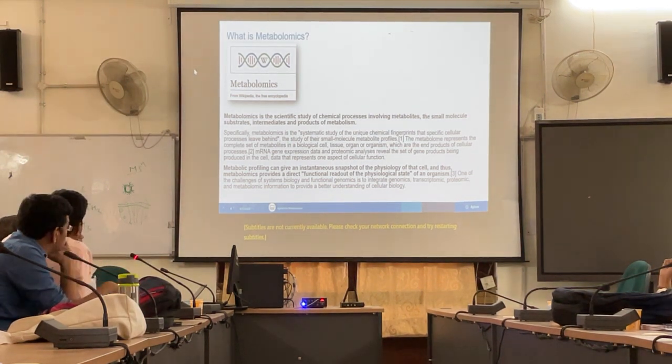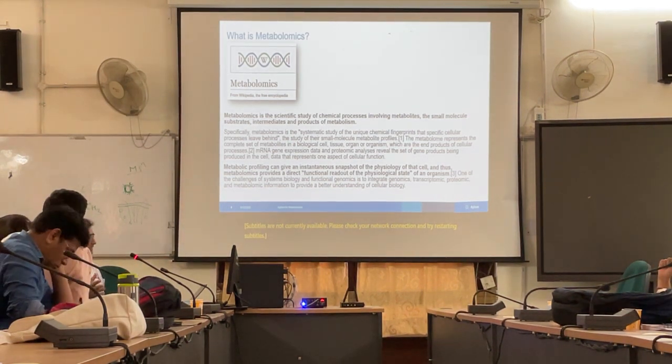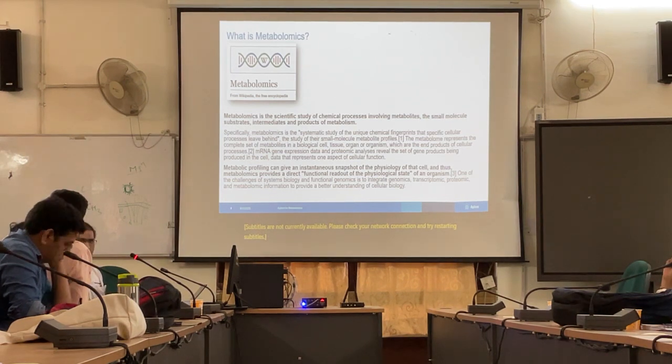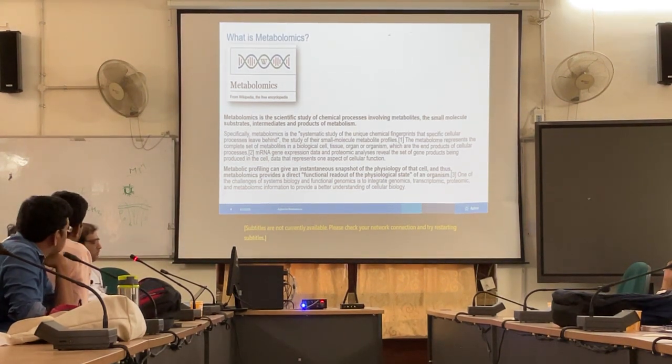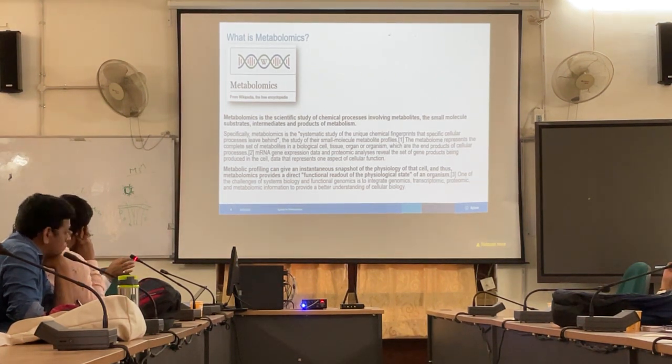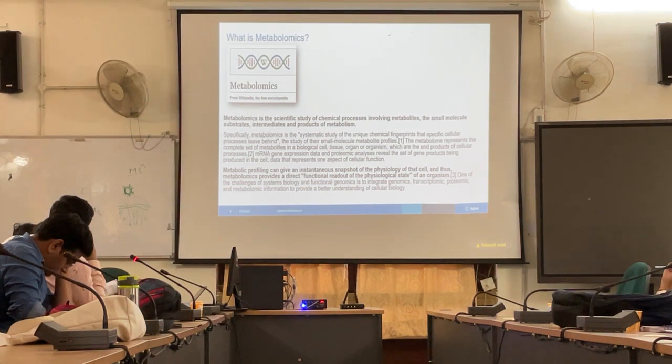Metabolomics is a new terminology which is coming into picture, but it is not something new to the concept of omics. For 20 years people have been working with omics, right? People started working with genomics, then proteomics, then metabolomics now. So the logic of metabolomics is the same as other omics, meaning it is not a very targeted analysis. It is mainly unknown, and as many compounds as possible.